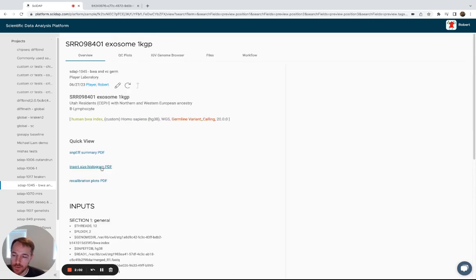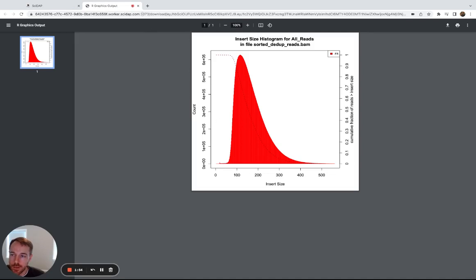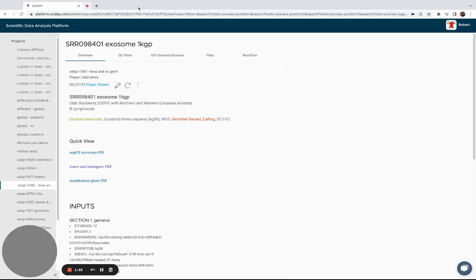So the first PDF is an insert size histogram, which shows you distribution of your insert sizes. You can check that against what's expected for your library.